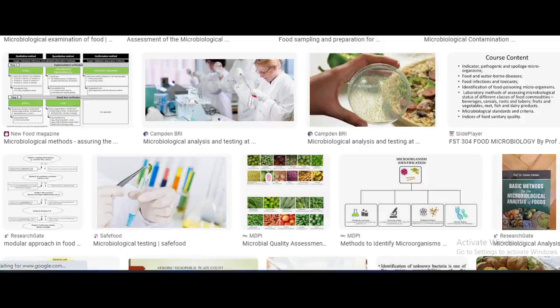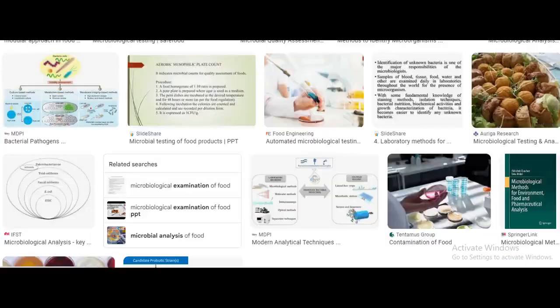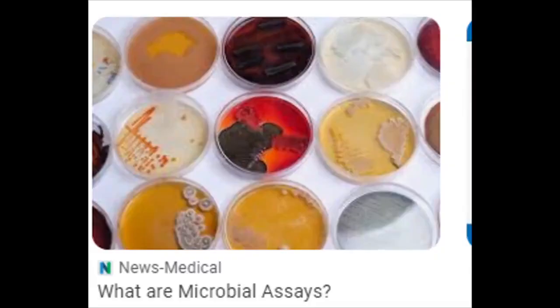But there are sometimes that the car will not be there and the lecturer will be in the office. So the indicator is just an indicator. It doesn't mean the person is there. But in most cases, in 90-something percent, once you see the indicator, you know that the man is in the office, or the woman. Are you following? The same thing in a food sample. You can use an indicator species to know if an organism, a bacterium or a fungus or a virus, is present in a food.